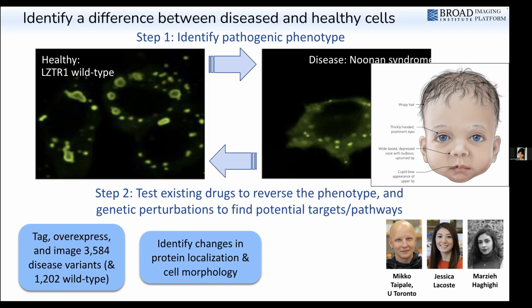For mutants with distinct profiles, we would get some insight into what the structural changes in the cell are, but also then be able to screen for drugs that can potentially revert that phenotype. Being able to scale up drug discovery like this is great, but we can go a step further and also do all of this in a pooled optical setting, and I'll talk about that in a little bit.